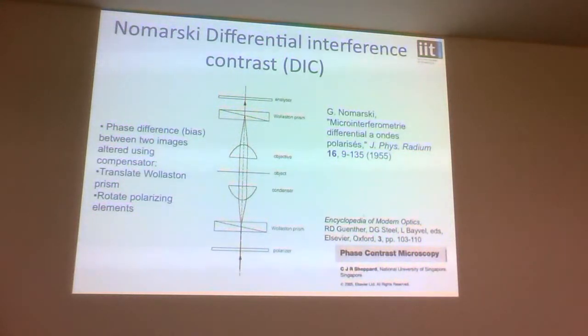Yeah, so I had a question. You mentioned there that they don't interfere in the sample. But if the light is just passing through, that interference is not caught in any way and it has no impact. So are you saying that it's somehow absorbed or interacting with the sample? No, I wasn't really saying that, but I don't know what would happen if you didn't have the polarizer. If two beams pass by each other, if you had a detector there, yes, you would see the thing, but if there's nothing to detect it, to catch the interference, then it has no impact. I don't think it would behave the same anyway without the polarizer. Exactly what it would do, I'll have to think more.